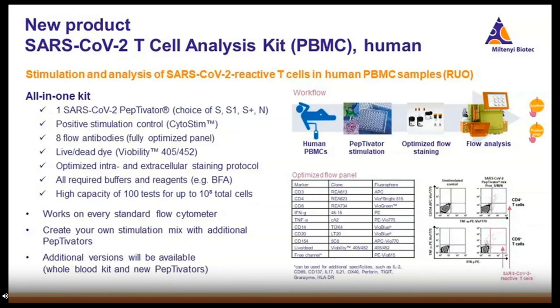And as you can see here in the plots on the side, these specifically activated SARS-CoV-2-directed CD4 and CD8 positive T cells can both be detected in just one sample through the combined analysis of various activation markers, like, for example, CD154, or cytokines such as gamma interferon or TNF-alpha.